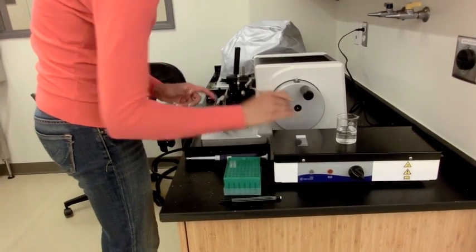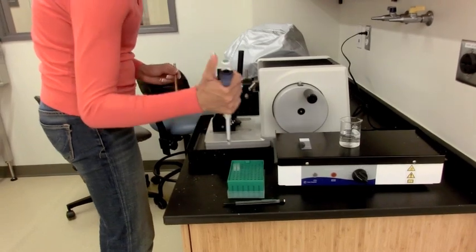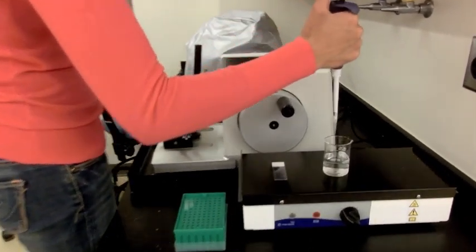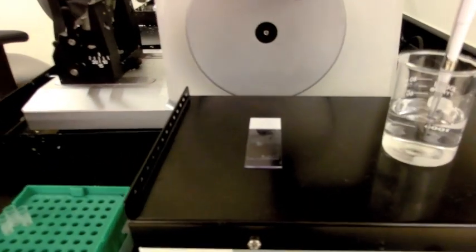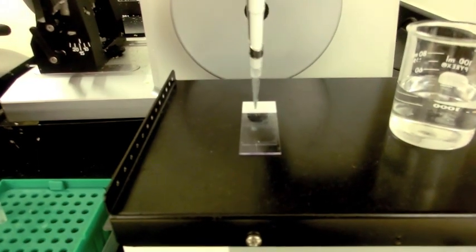Remove a blank slide from the box and label it with your initials, organ type, and date. Place the slide down on the warmer and using a transfer pipette put a few drops of water onto the slide.